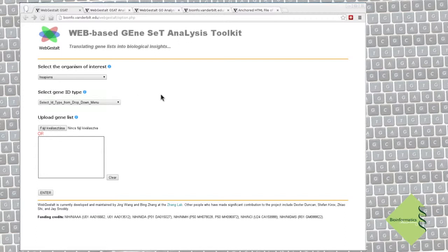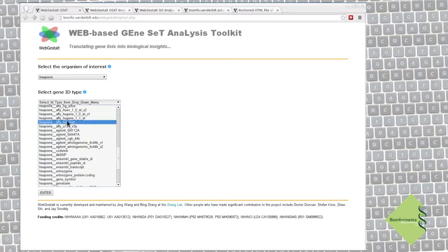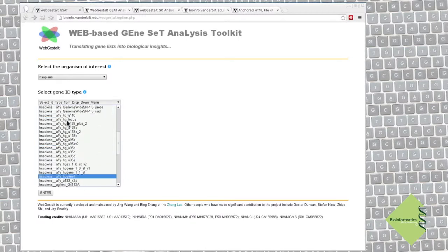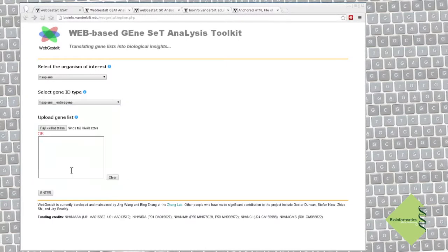Next, we have to say what kind of IDs we use in our gene list. As I mentioned, we use entry gene IDs. And here we can upload our file. Upload.